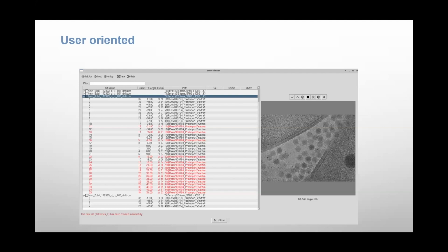So you can mark them and then they will not be used in your image processing. And this information is preserved in the next steps. So they appear as marked as not used, but you always know what you removed from the beginning.